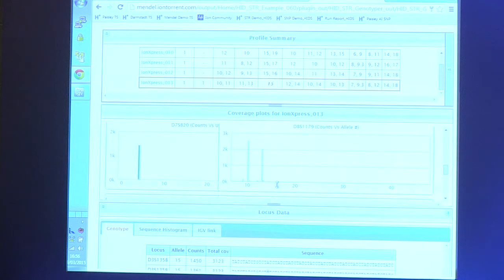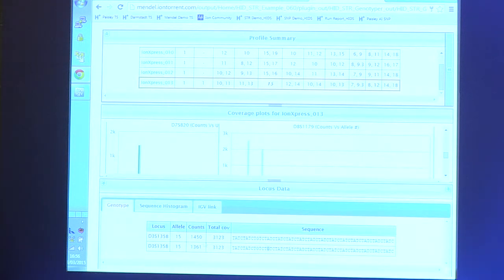And then to complete the picture, if we look further down, we have that same information in tabular form. So I have a nice illustration here selected already. You'll see here in sample number 13, you see the apparent 15 homozygote selected here for the D3 locus. When we look into that in more detail, you'll see that there are actually two different alleles represented, even though to a size-based method of separation, it only looks like one, because they both have 15 STR repeats inside them.